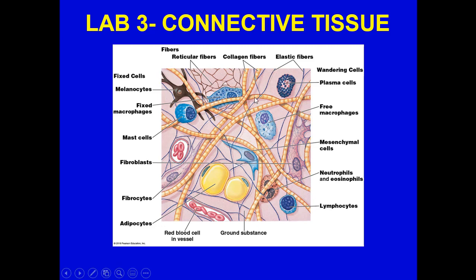All of these are defending against foreign antigens, foreign proteins, bacteria, viruses, fungal cells, etc. Also, from pigmentation, you will have melanocytes, which produce, yes, melanin. You will also have lymphocytes, neutrophils, and eosinophils, as well as mast cells, which also add sort of a protection for this. Now, the mesenchymal cell adds to the productivity of some of the fibers and adds to the ground material. Remember that all this space here that you see that's in purple, that's all ground substance, okay?